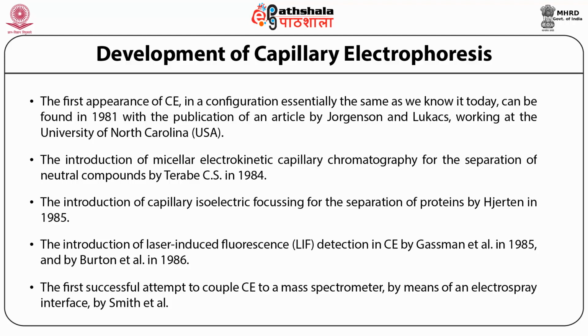Separation efficiency in free solution, as performed by Tiselius, was limited by thermal diffusion and convection. For this reason, electrophoresis traditionally has been performed in anti-convective media such as polyacrylamide or agarose gel.